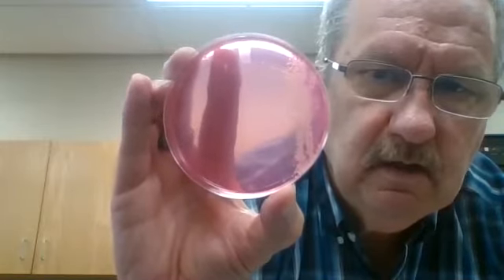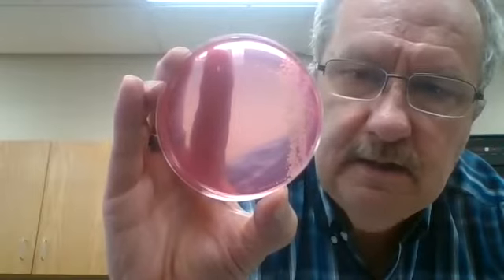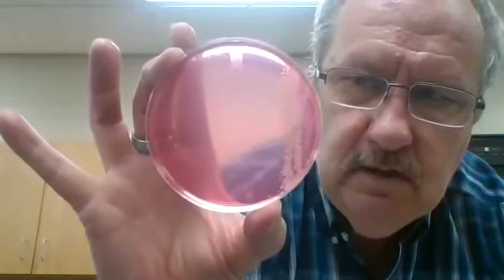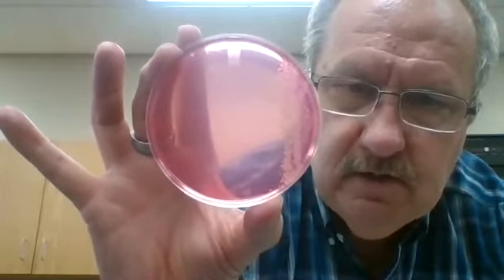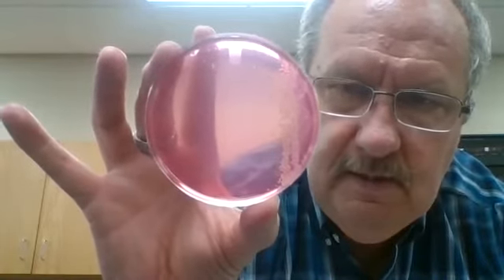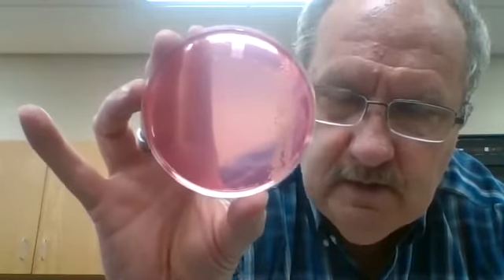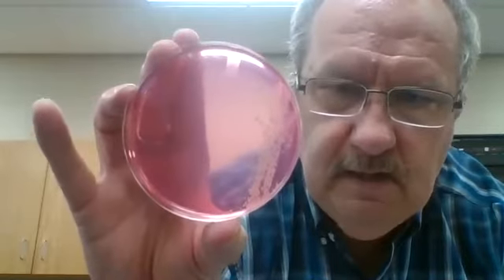Putting my finger behind the colonies — they're small circular colonies and they're off-white. As you can tell, the medium is still completely pink. There was no mannitol fermentation. In mannitol salt agar, if you get mannitol fermentation, the media actually turns yellow. So for mannitol fermentation for each of these three colonies, that would be negative.